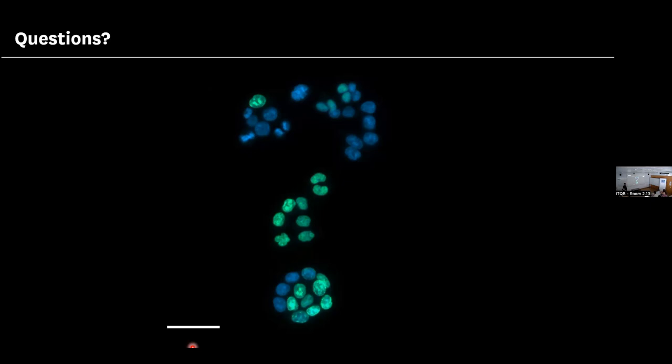So you said that in the spinning disk you can have different pinhole sizes. My question is a technical one: is it possible to have the same microscope and exchange the spinning disk for a brand new one that just came out, where the pinhole is even smaller? Yes, it can.